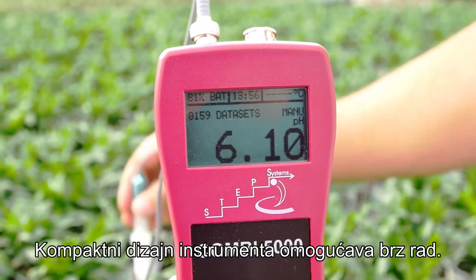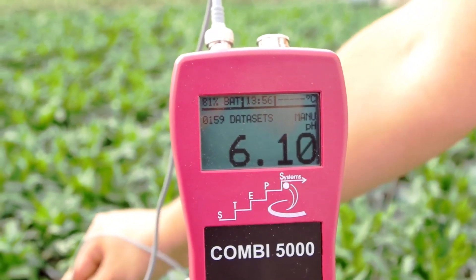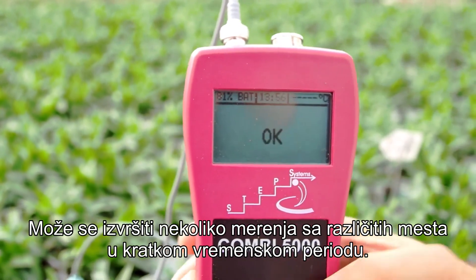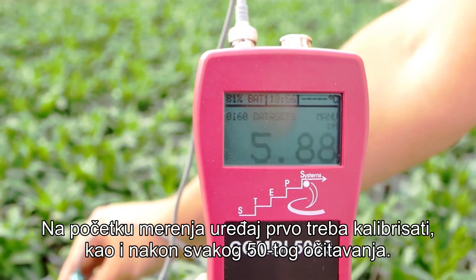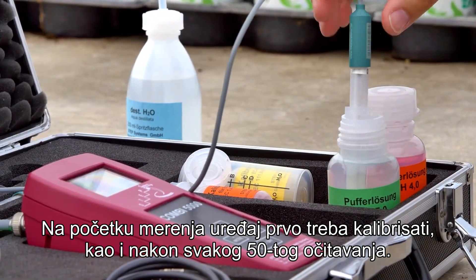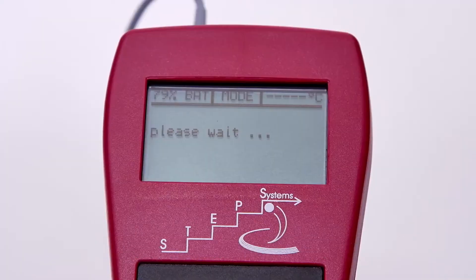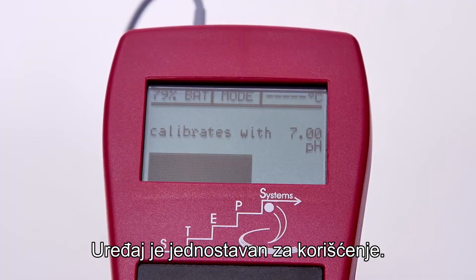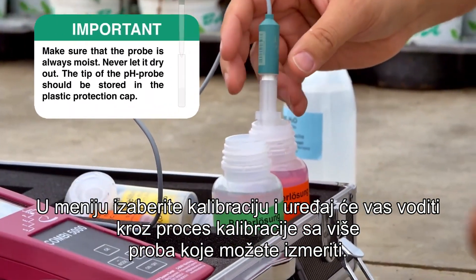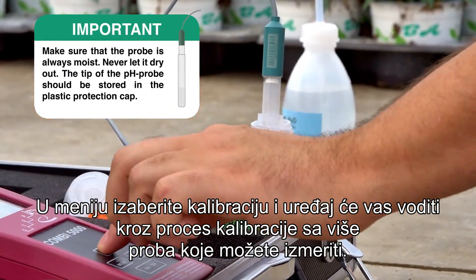The compact design of the instrument allows for a fast workflow. Several measurements can be taken from different places within a short time. The device should be calibrated for pH at the start of the measurement and after every 50th reading. Calibrating the device is simple: select calibration from the menu, and the device will guide you through the calibration process.